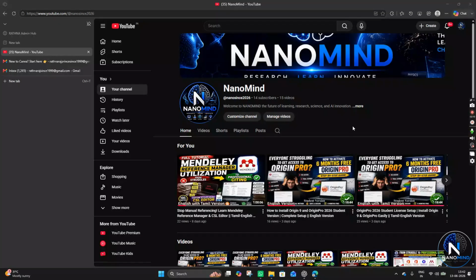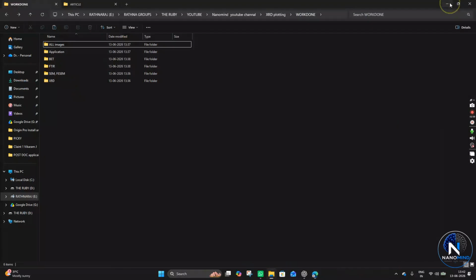I will show you in this video, and in the next upcoming videos I will continue this XRD series about all the things about XRD first, because everybody in materials research must follow initial study about XRD: how to analyze, how to confirm the materials, and how we need to move on after the XRD. After that only we need to do some other analysis. That is the main thing. So let's get started.